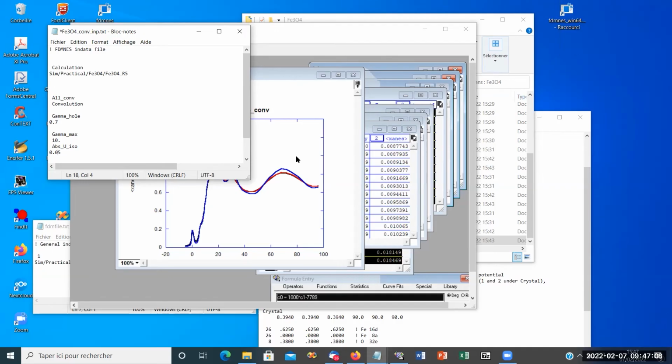Yeah, could I ask a question? Yes, please. I wonder how to calibrate the energy. I noticed that the edge now is about 0, and if we want to compare with different samples, how to do the energy calibration? Can we also compare with the standard samples?